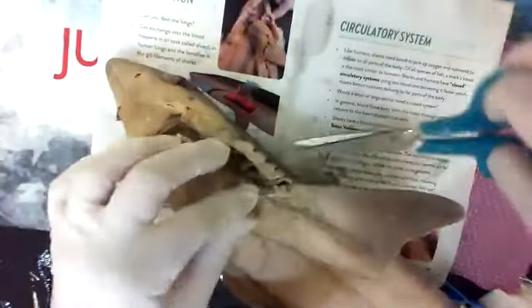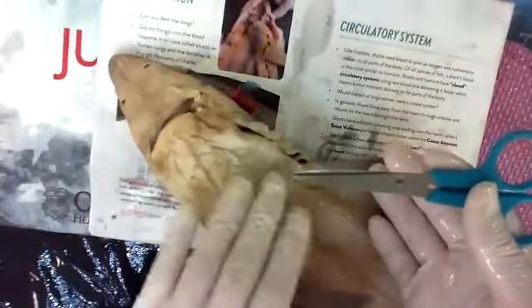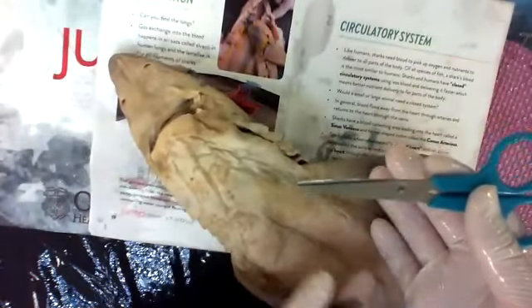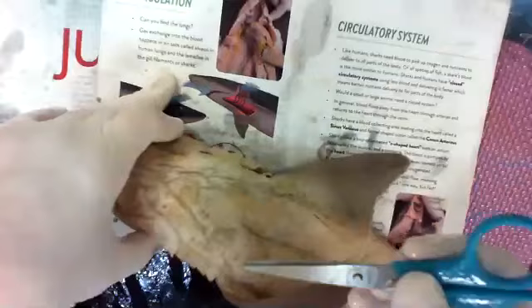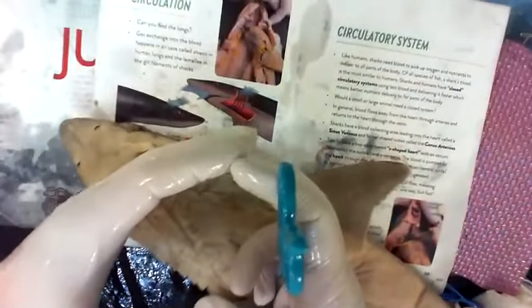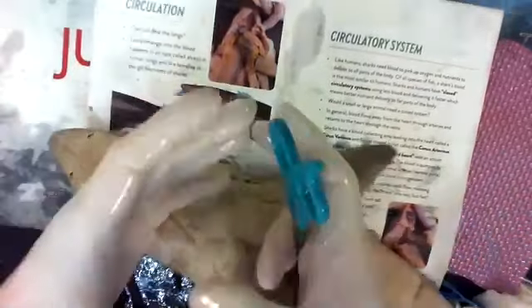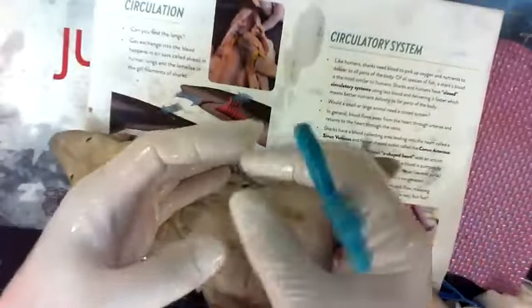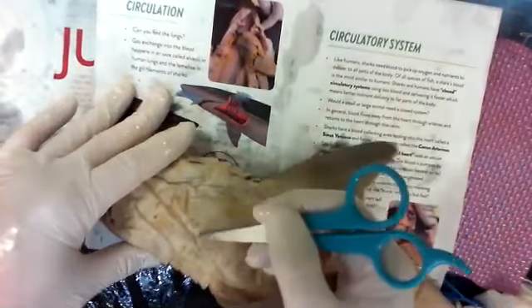Right? I'm going to do something that's not in the book, but I'm going to show you how you can skin a shark. You can actually skin anything like this, but every organ in the body has a wrapper. Your brain has a wrapper. It's called the meninges. If you do the stem where we cut the internal organs, you'll get a brain that has the meninges on it, and we'll actually cut it open. You'll feel it and everything. But the meninges protects the brain.